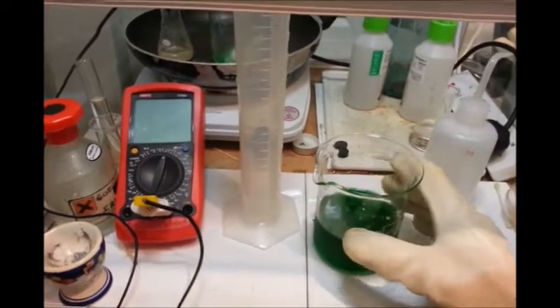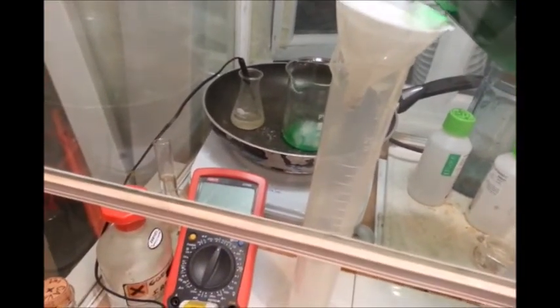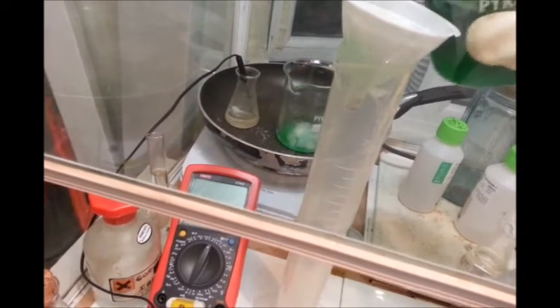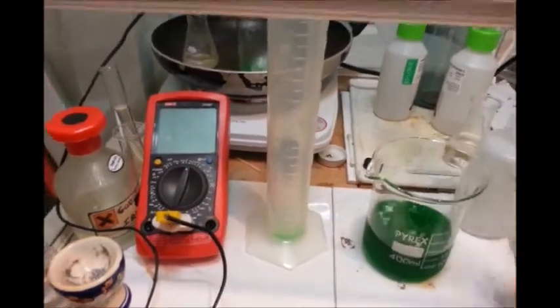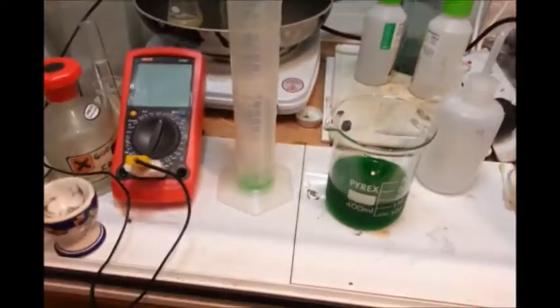Right, now all the ice has melted, and for the sake of ease I'm going to filter into a measuring cylinder, because it's taller and that's the only size filter paper I have at the moment. So I'm just going to slowly add this until it's all been filtered — it's going to drip down there and take quite a long time. So I'll come back when it's all been filtered.